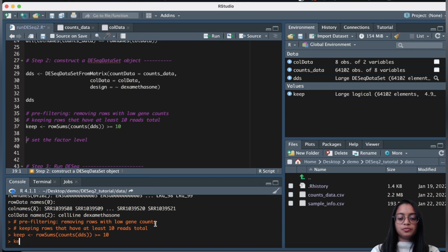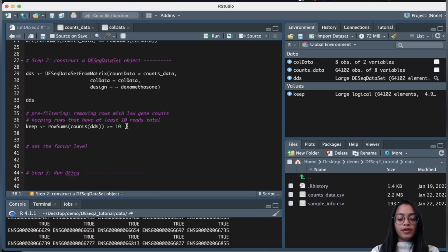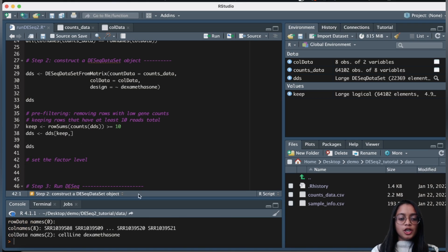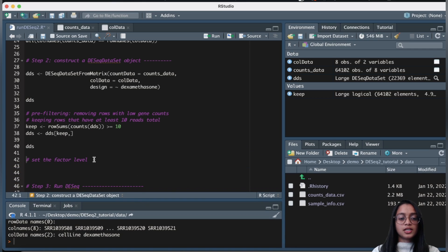The 'keep' variable now has all the gene IDs with TRUE or FALSE values. If a row fulfills the condition of at least 10 reads, it gets TRUE; if not, FALSE. We use these logical values to subset our DESeq dataset object. Now looking at the filtered DESeq dataset object, we went from over 64,000 rows down to over 22,000 rows — we've filtered out many rows that had very low gene counts.